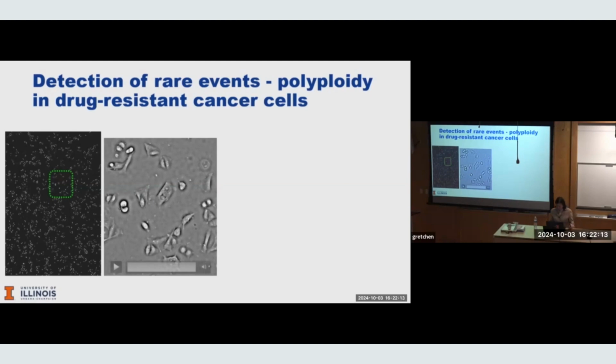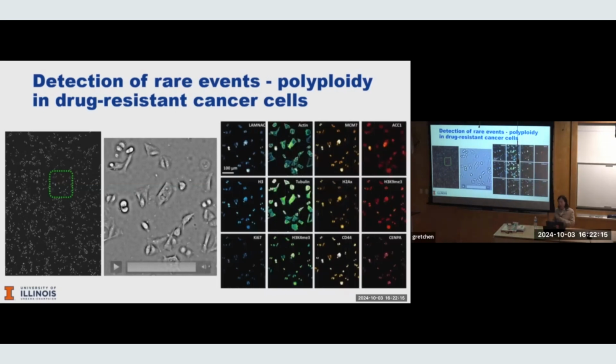So what we did, the next step, is to do high content phenotyping on exactly the same set of samples. We basically monitor them dynamically and then fix them and do a sort of cyclic fluorescence imaging with multiple colors. The set shown here is 12, but we did, I think, a total of 30. So here we're just showing different molecular markers that reflect this dynamic behavior.